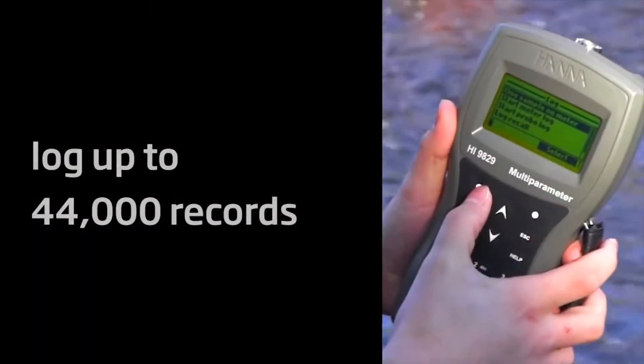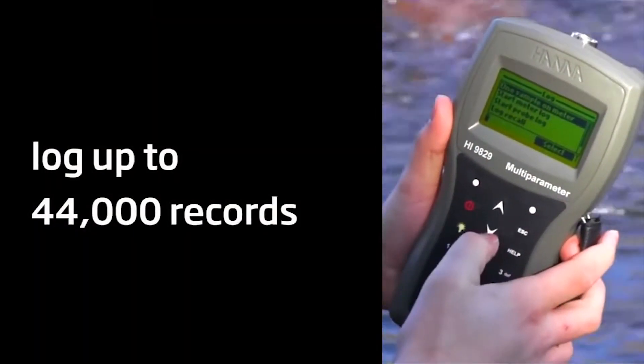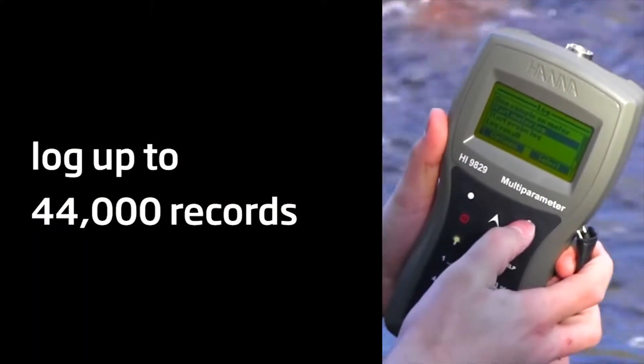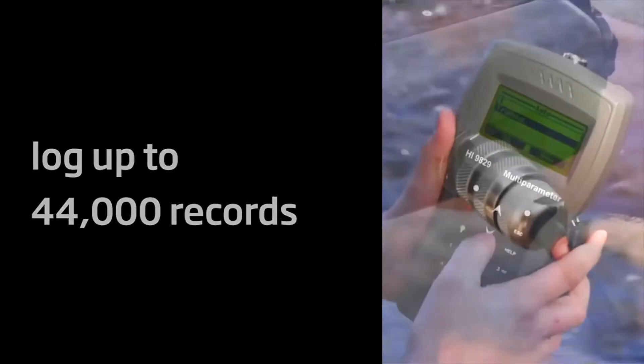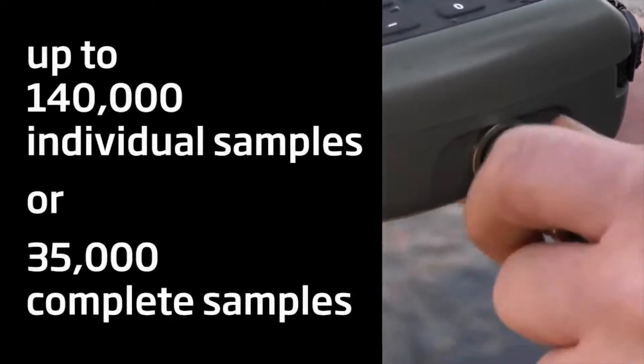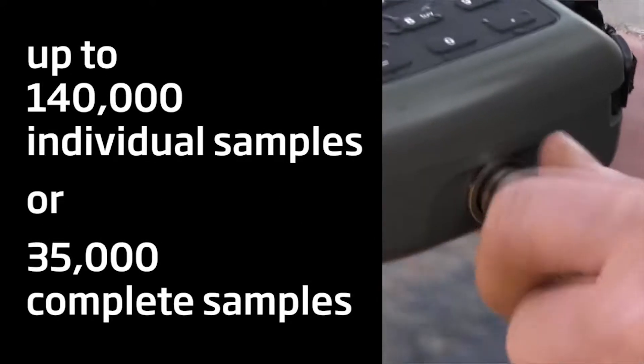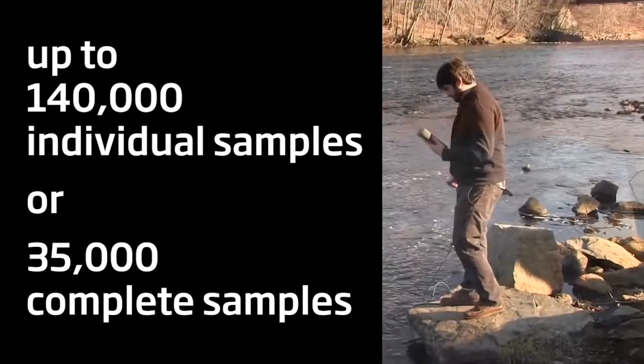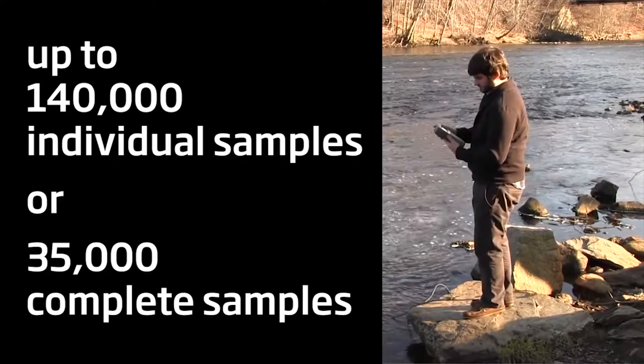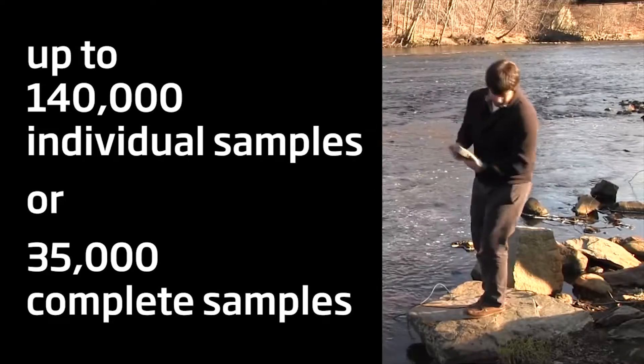It can log up to 44,000 records and offers an optional autonomous logging probe that has a logging memory of up to 140,000 individual samples or 35,000 complete samples.